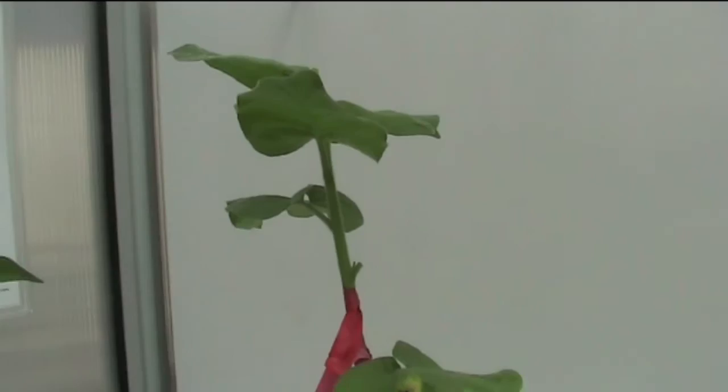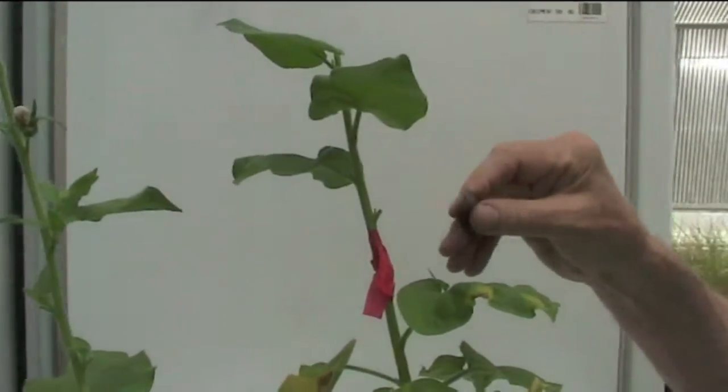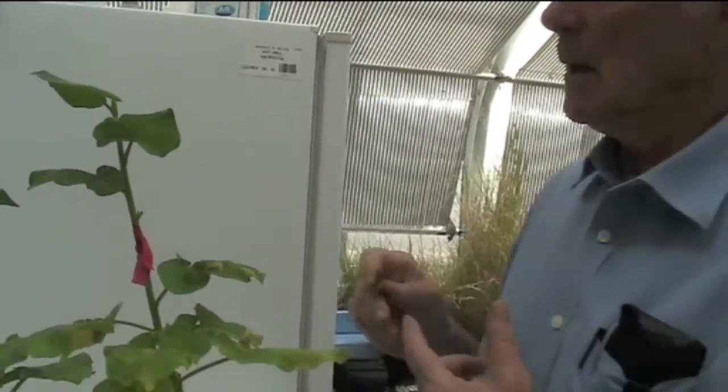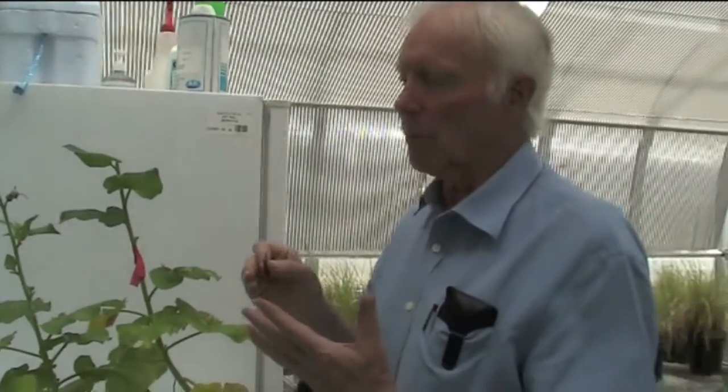This technique can be used with dicotyledonous plants which have vascular bundles. Unfortunately we can't use this technique for monocotyledonous plants where we have parallel venation. This method allows us to transmit viruses which are contained in certain tissues such as the phloem but don't actually get into the leaf sap when we extract it. So this is a better method for ensuring transmission of a symptom even when mechanical inoculation fails.